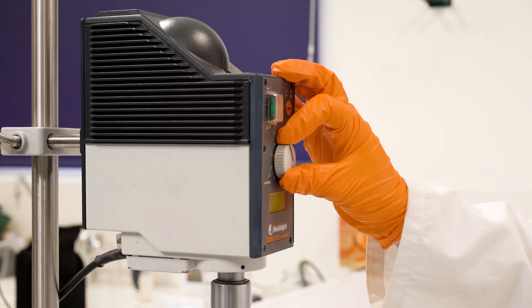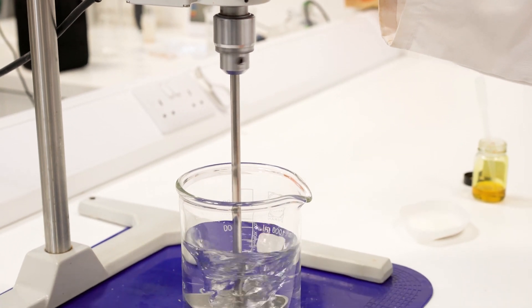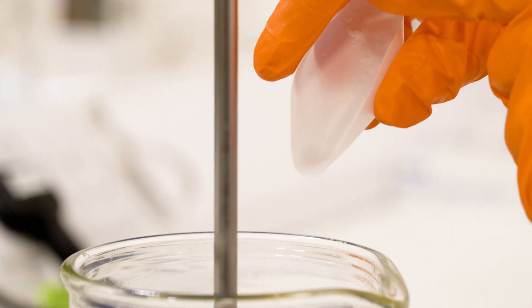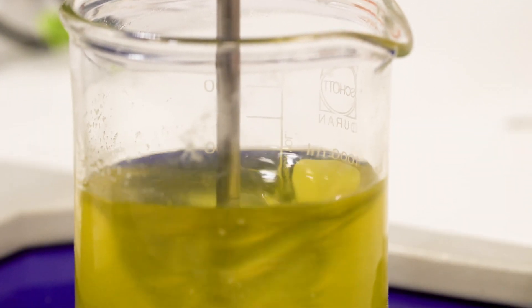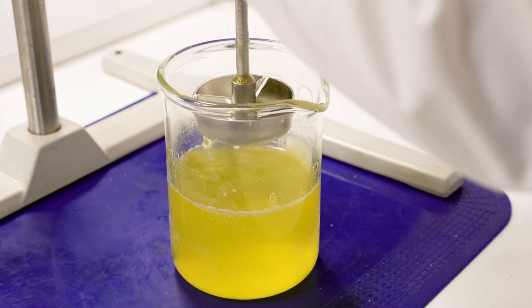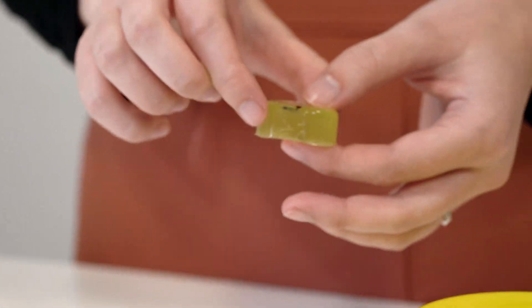This is stirred in exactly the same as normal gellan gum but at a higher level. You incorporate it when the water is cold, heat it up to 80 degrees, then add a calcium ion which boosts the gel structure. Once the calcium ion is incorporated, you switch it off — and in this case we've made a yellow rigid gel.